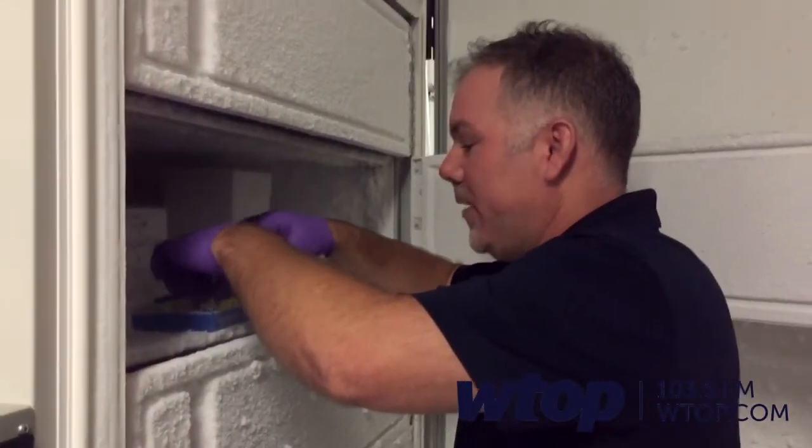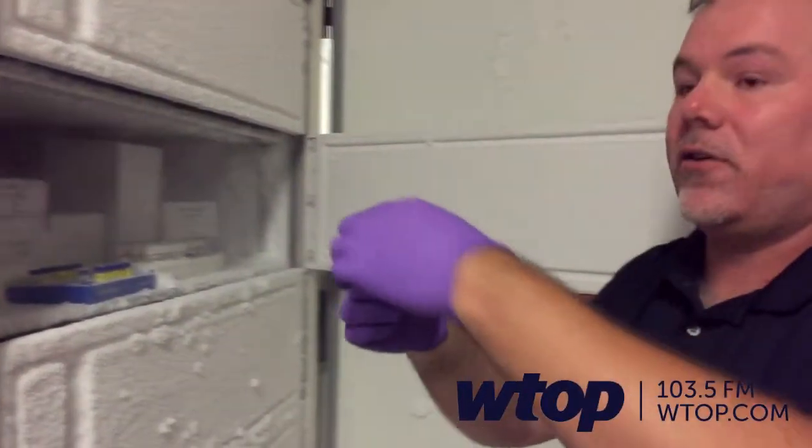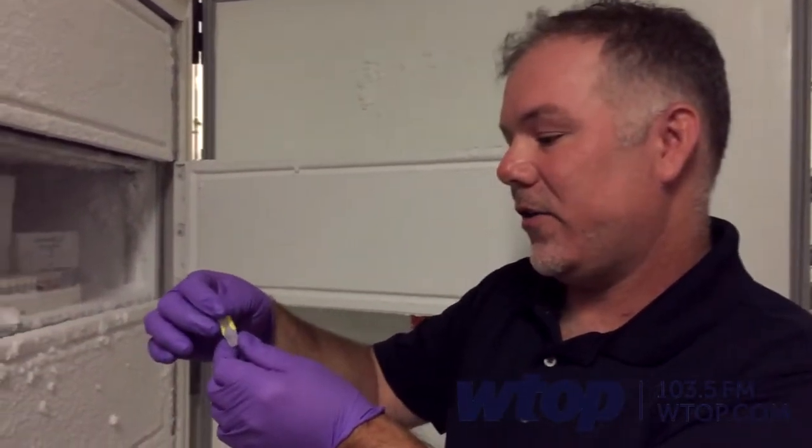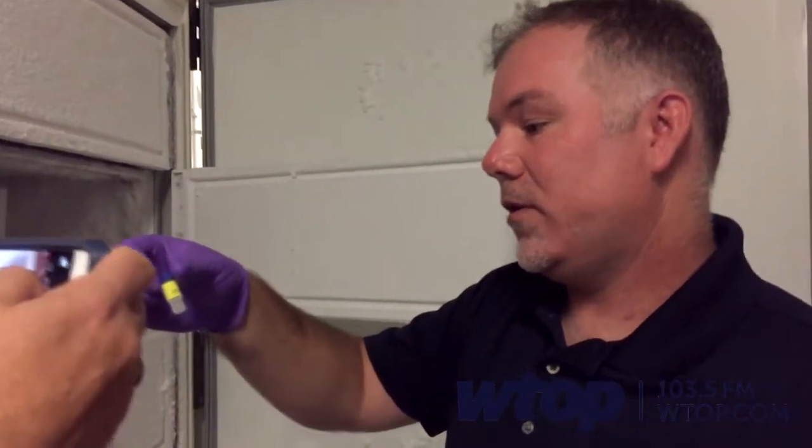We also do contamination control analysis for the OSIRIS-REx mission. They have witness foils that you extract, and a lot of these vials are from that analysis. So this one is 19U, done on 8-4.